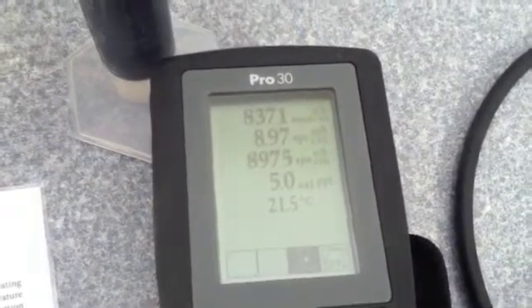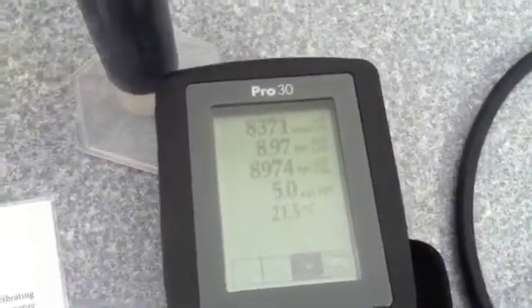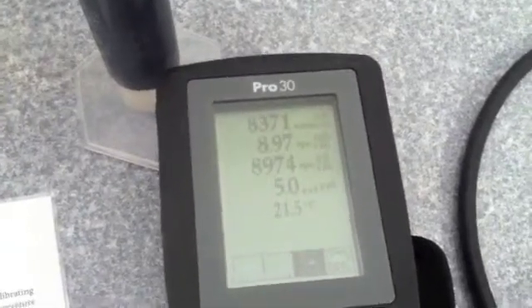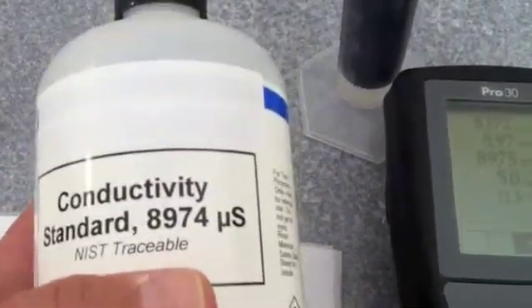We're going to do a calibration on a YSI Model Pro 30 conductivity handheld. We already have our probe in a solution of conductivity standard, and the conductivity standard that we are using is 8974 microsiemens.